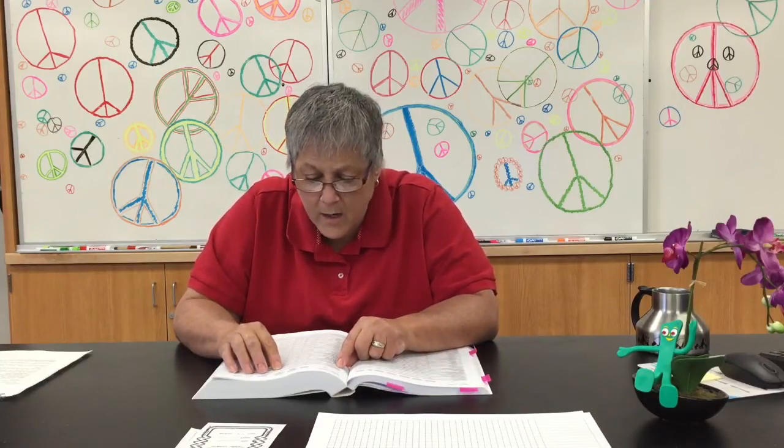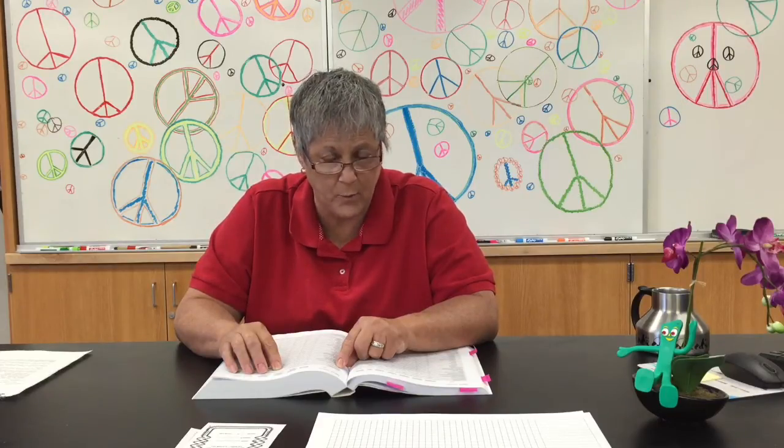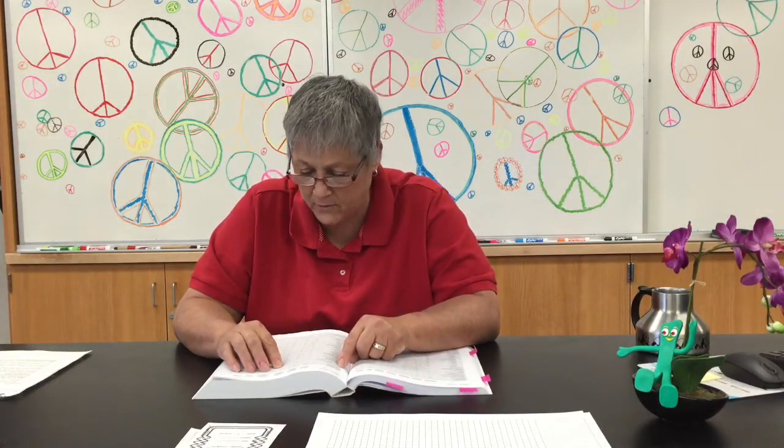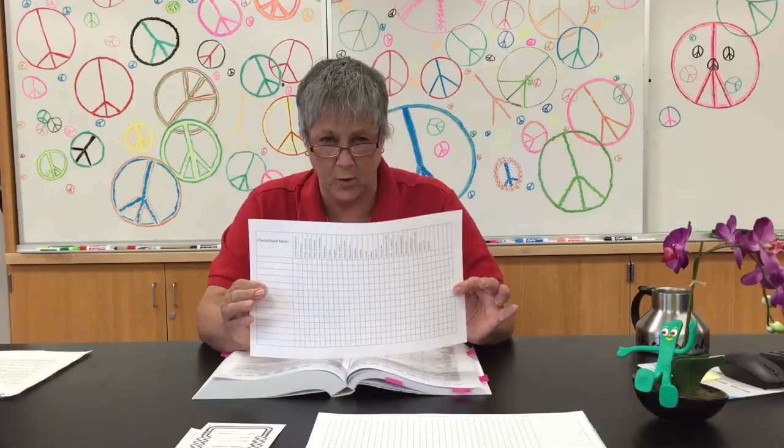It's gram-negative, it's oxidase negative. Methyl red is variable, okay, because what I'm seeing reported for the methyl red results is a negative sign in brackets. Okay, I'll come back and talk about what variables mean in just a couple of minutes, or I should say how variables are recorded in Bergey's manual. It was indole negative, let's see, VP positive, citrate positive. Terrific, so I'm finding lots of information about Klebsiella pneumoniae, subspecies pneumoniae here in this table, and I'm recording that information on the checkerboard matrix.